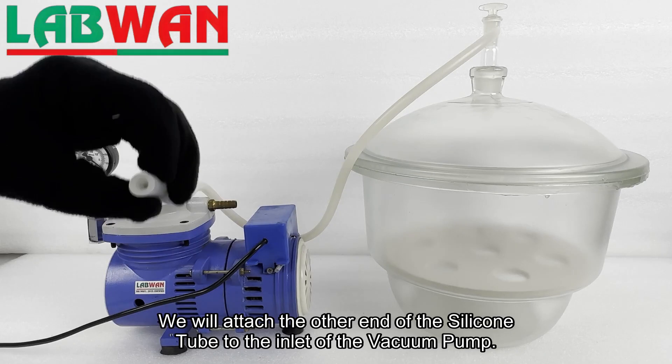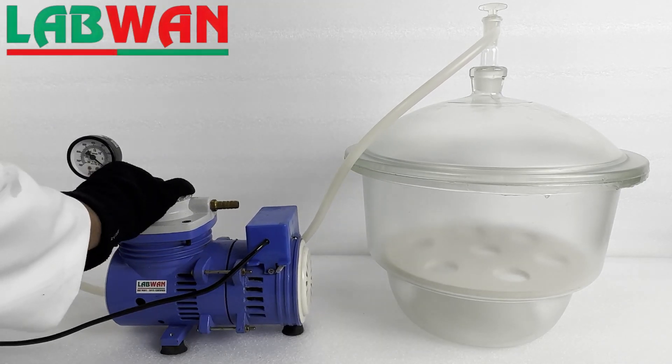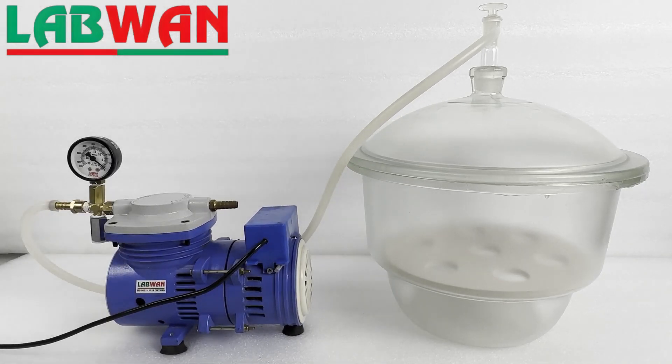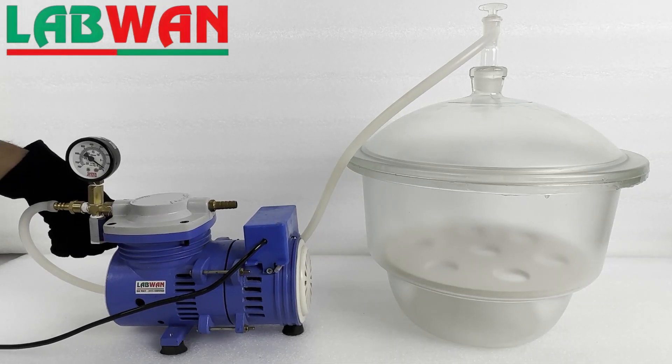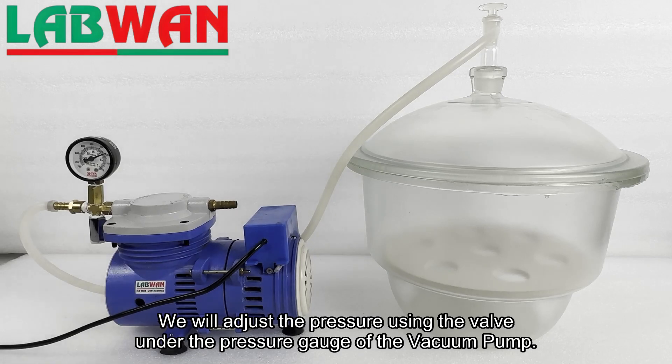We will attach the other end of the silicone tube to the inlet of the vacuum pump. Then we will turn on the vacuum pump and adjust the pressure using the valve under the pressure gauge of the vacuum pump.